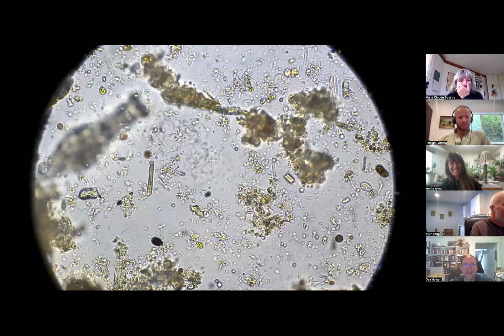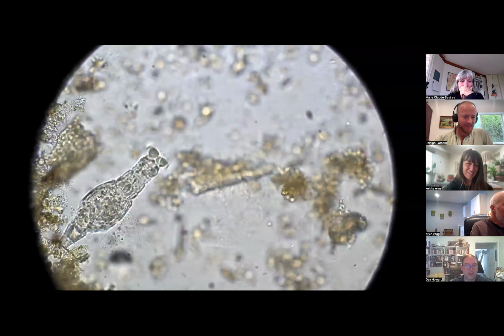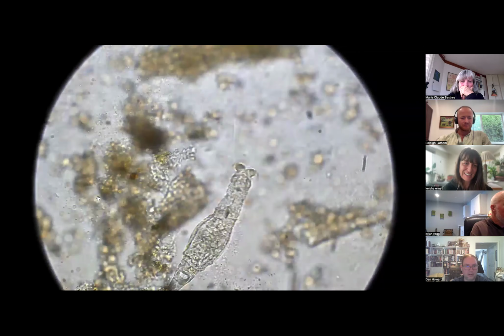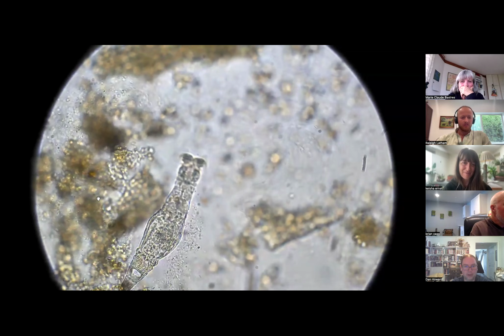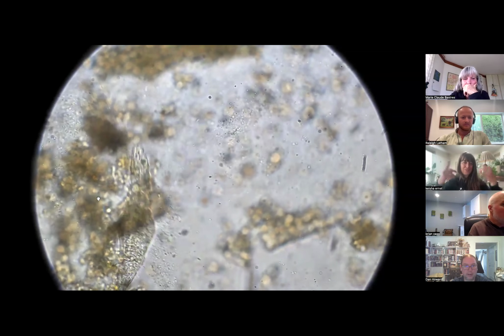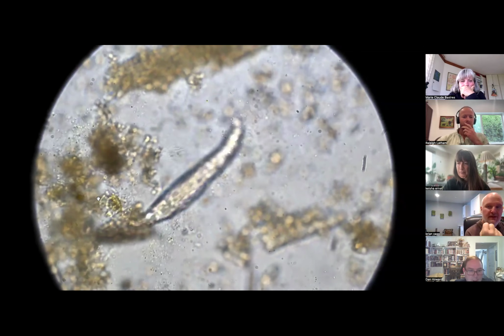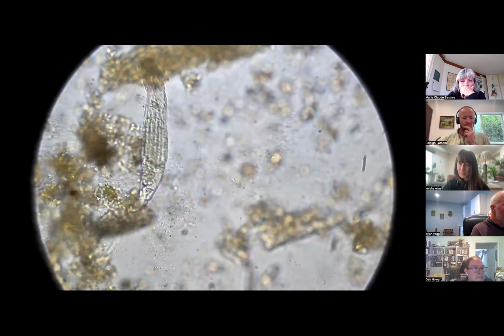Brian, that's a rotifer slightly out of focus there, right? Yeah, that is a rotifer, and you can see when that rotifer is just pulling in that vortex. Rotifers are just fascinating creatures to look at in the microscope. You can see that soup. It's just using those rotors to make a vortex, and it just sucks in bacteria, and you can see that it has this device that's just crushing bacteria as it pulls into its esophagus.